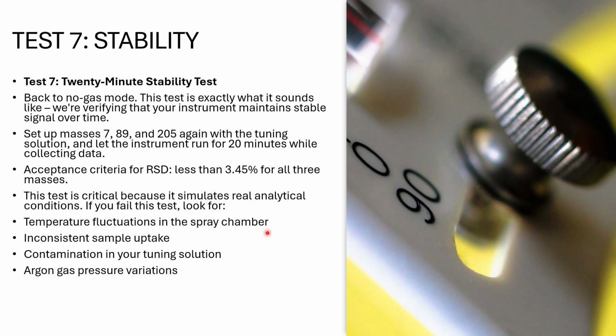If you fail this test, look for temperature fluctuation in spray chamber, inconsistent sample uptake, contamination in your tuning solution, and argon gas pressure variation.